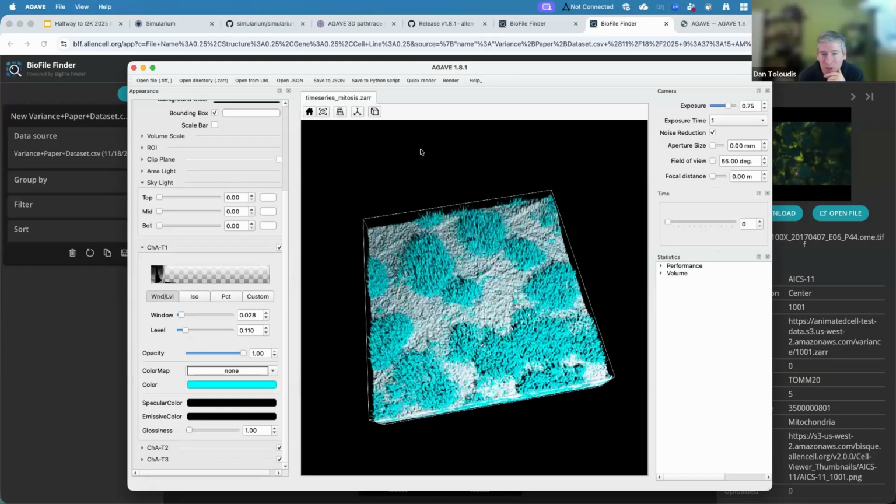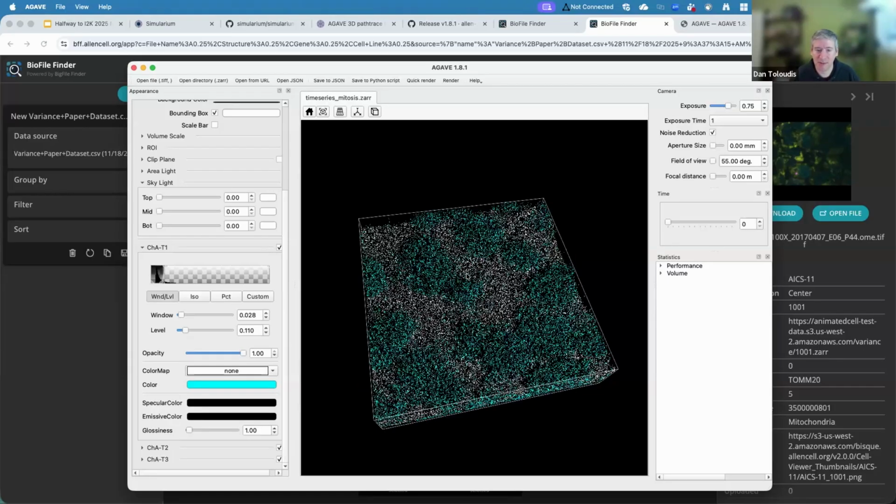It also supports hard surfaced geometries, right? It's probably more specialized for triangle mesh geometry data in general. It's also a fully featured animation and filmmaking toolkit, so it has a vast amount more functionality than what Agave provides. But yeah, it's not specialized for biological image data, and I would say it's generally not specialized for this type of volume rendering, at least not in a live viewport like this.